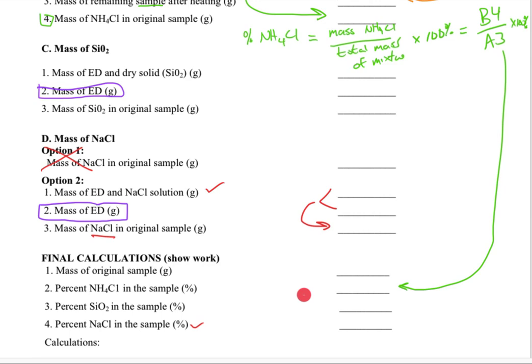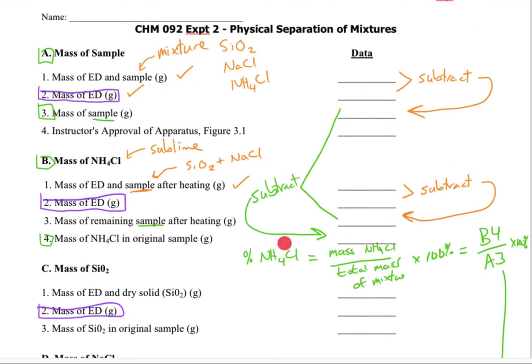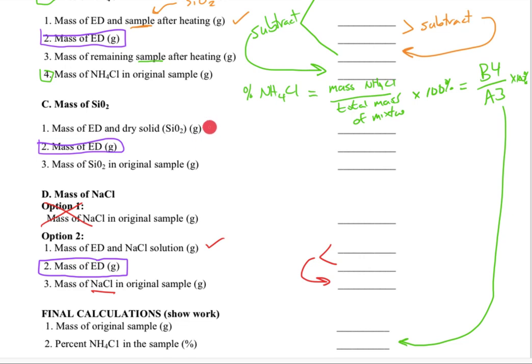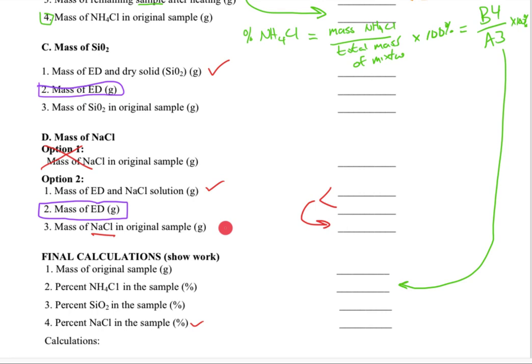In the video, I demo the experiment, I talk about the experiment, and then you're going to see the mass measurements on balances. You simply pause the video when you see those balances. I've made notes in the video, and then you'll just record the specific data points. I've already shown the check marks where you're going to see data. You'll also see this data, and you'll also see that data. Part of your job is to read the procedure, be familiar enough with it, and watch the video and interpret what you're seeing, along with my explanations.